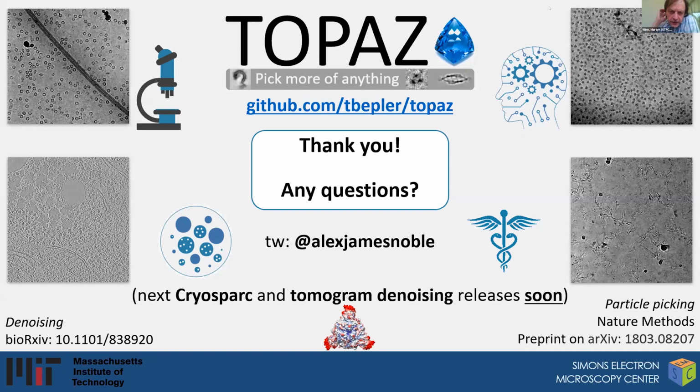So from Magdalena Schachel, what is the size limit for particles that is successfully picked with Topaz? So there's, yeah. Go ahead.